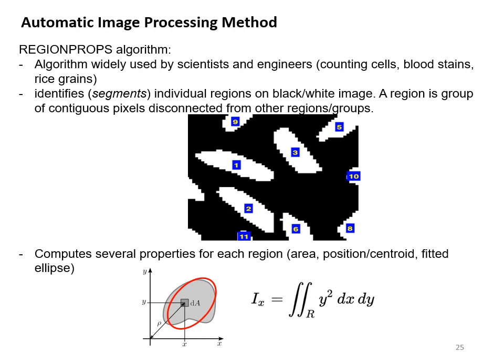So you see here a gray region and a red ellipse. So the way it works, it's by a physical argument based on the equivalence of the second moment of inertia between the ellipse and the region that has been identified. Imagine that you would rotate this ellipse along the two main axes of the ellipse. You would need the same energy as when you rotate the original region. So that's how the ellipse is fitted. And for a shape like this, it's not possible to perfectly fit an ellipse because it's not an ellipse.